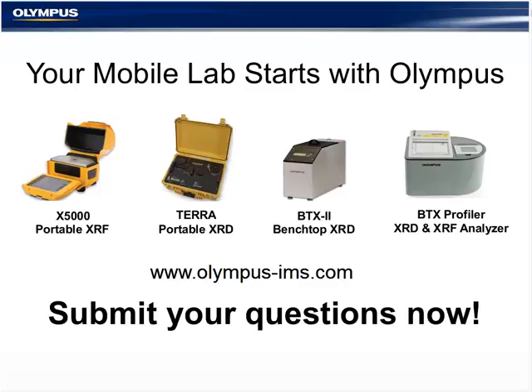The key, the secret sauce to accurate, repeatable, and useful XRD and XRF is always in the sample prep. And this begins with a human factor. Accurate sample catching and recording of that inventory is essential. Your next thing that's important is cleaning the samples. Depending on the type of drilling muds, whether you have water or oil base or synthetic oils, the right solvent, the right surfactant, or right cleaning solutions need to be chosen.